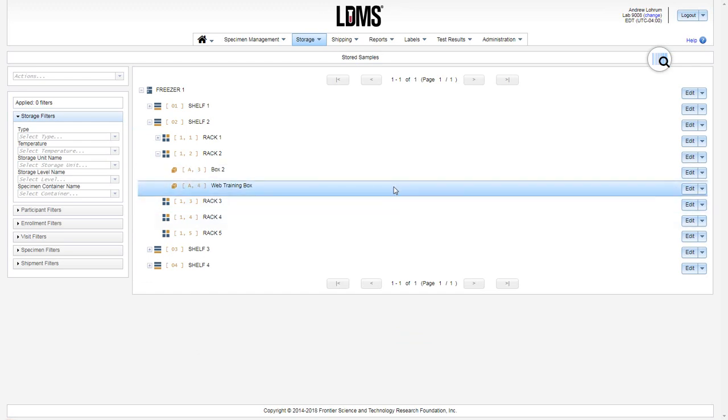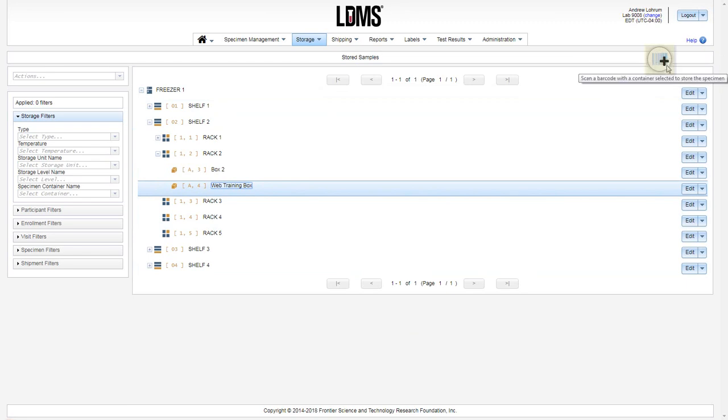Now we are ready to add specimens to our box. Once I've highlighted a box name, my barcode badge at the top of the box will appear. The drop down has changed to a barcode with a plus sign. This means that I can utilize the barcode at this point to scan the specimen and then assign the position.